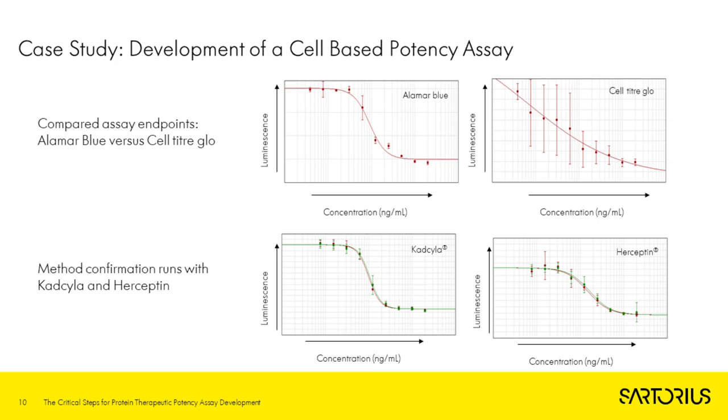And based on the preliminary work developed in the platform, we can then quickly optimize further for potential candidate molecules which target HER2. And we can also use the same systematic approach to apply for other molecules with similar proposed mechanism of action, but with a different target.